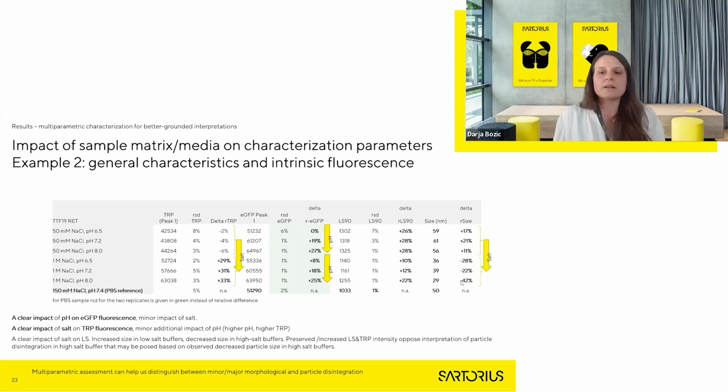In this particular case, we observe an increase in light scattering intensity, as well as an increase in tryptophan fluorescence. So this is contradictory to the hypothesis that the decrease in size is linked to degradation.